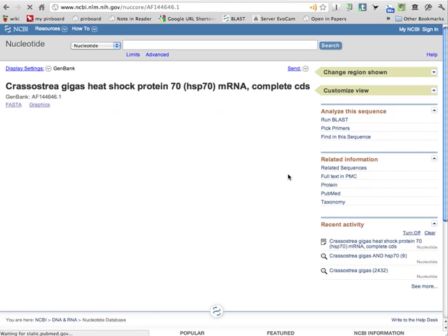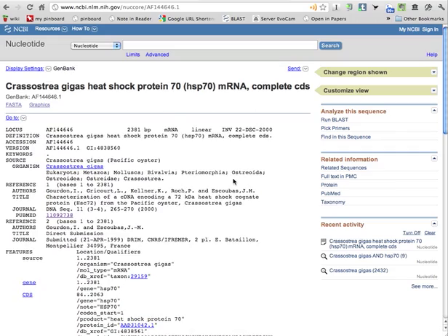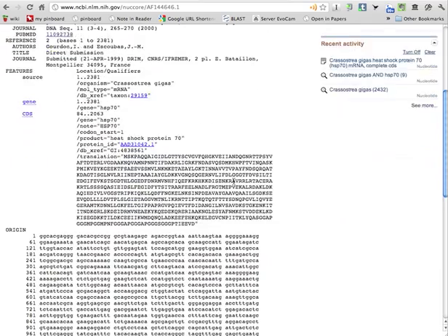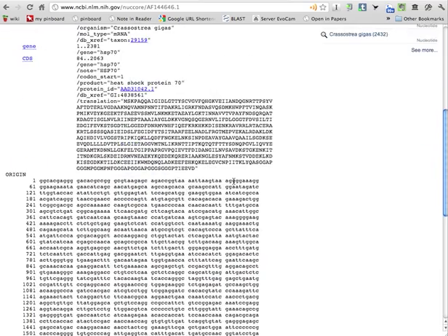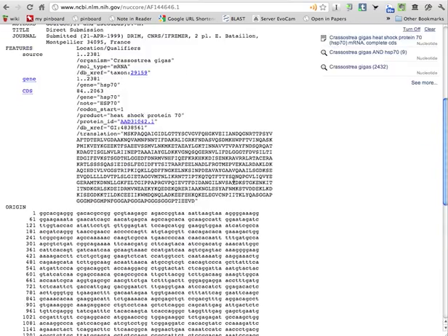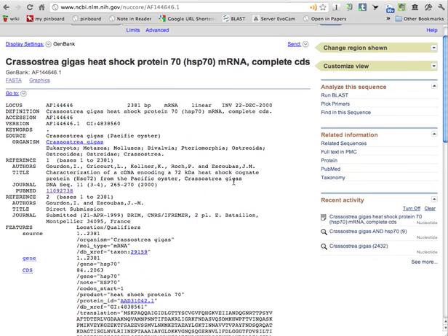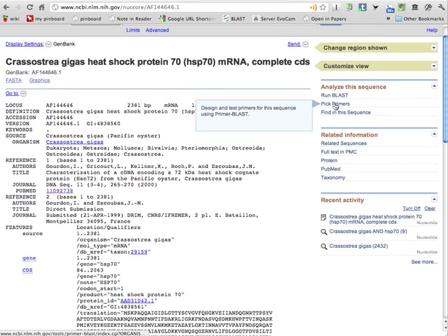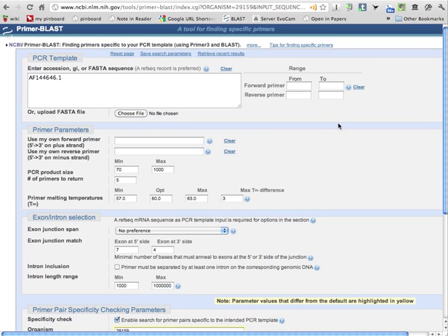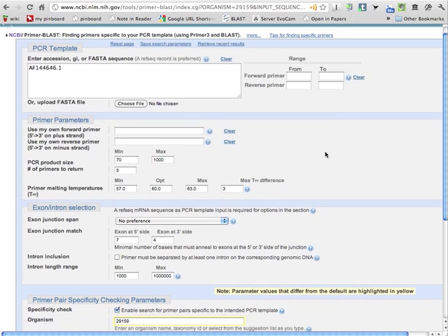And eventually, one way or another, you'll come to a particular entry for a single gene. It looks something like this. This is the gene sequence, protein sequence, and you can simply just hit this thing. It says pick primers. There you go.